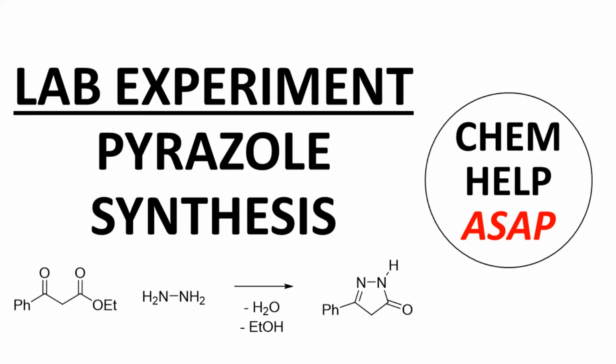In this video, we'll do a demonstration of a reaction that makes a heterocycle called a pyrazole. The video description contains links to supporting documents, including the laboratory procedure and proton NMR spectra.